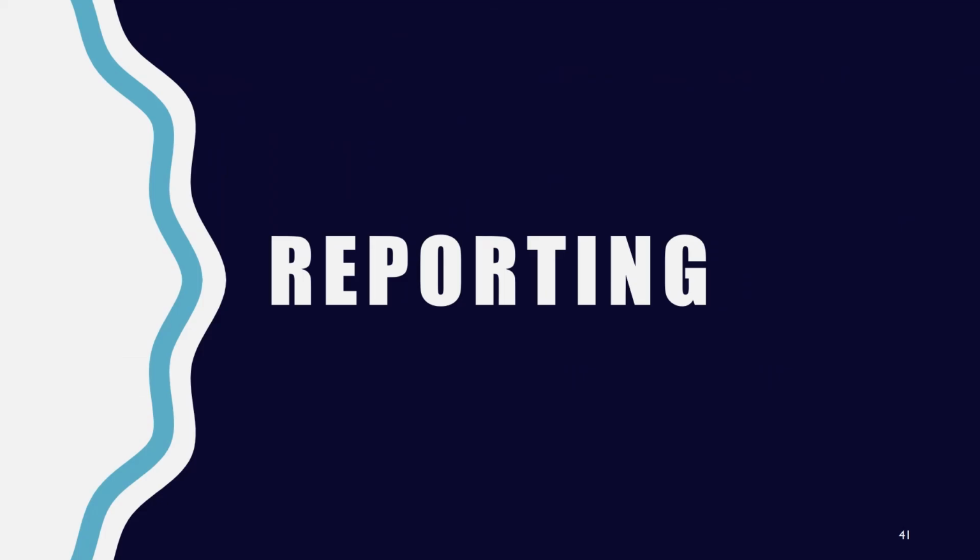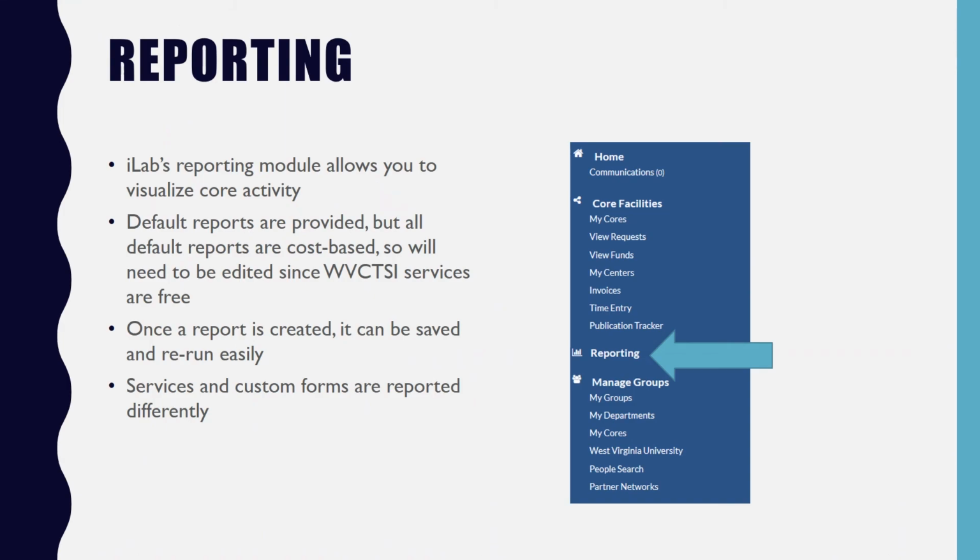The next feature I will cover is the reporting module. iLab's reporting module allows you to visualize core activity. iLab provides some default reports, but those tend to be cost-based, so you'll need to edit them since most WVCTSI services are free. Once a report is created, it can be saved and rerun easily.